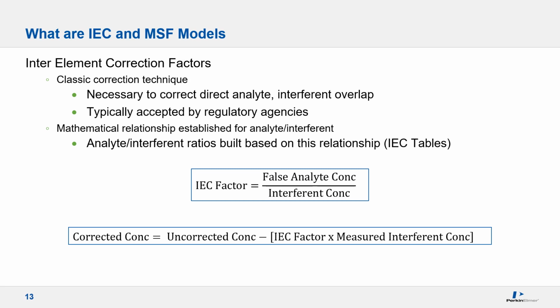Determined IEC correction factors are highly dependent on plasma and sample uptake conditions. The plasma and sample uptake conditions must remain constant. Also, prior to determining IECs, background points and integration areas must be correctly positioned. IECs will need to be recalculated in the case of any changes.